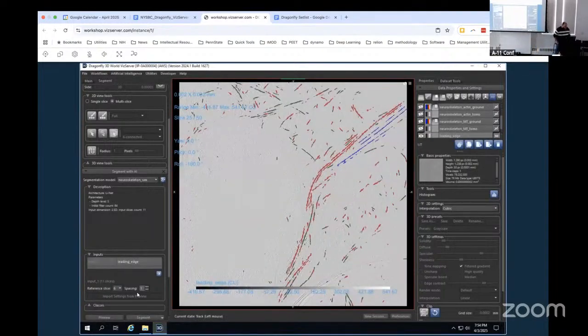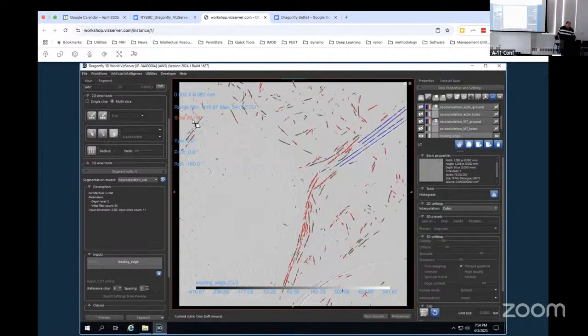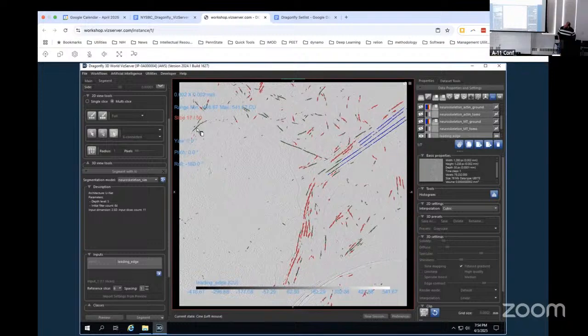So it's not perfect, but you had to do almost nothing to get this network, other than, well, that's not totally true. It finds the microtubules quite well. It's separating actin and, you know, the other filaments. Now it's not perfect, right? There's obviously little bits here and there mixed in that may or may not be real. I don't know. Getting the tip of this microtubule is actin.